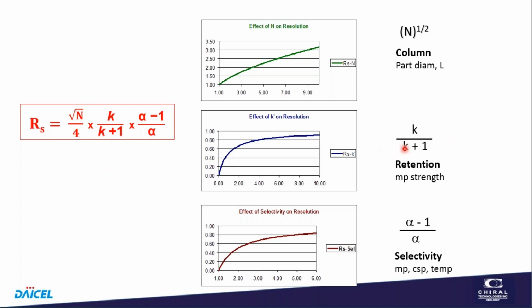Retention factor, and we'll describe the equation for that in a moment. If you increase the retention, the improvement in resolution starts to drop off after maybe 5 or so initial column volumes, or a retention factor of 5 or so. So if you go from 5 to 10, you double the retention time, but you make a relatively small improvement in the separation.